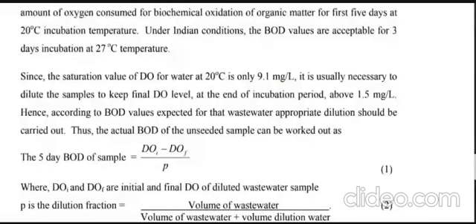Now in this case, one more factor that we have is the dilution factor. So what do you mean by dilution factor, and why do we need it? Just like I said, if the concentration is much higher and you have only a very small amount of microorganisms present, for example 5 gram of organic matter and only 5 microorganisms having the capacity of 1 milligram to decompose per day, it means the 5 microorganisms are decomposing only 5 milligram per day.